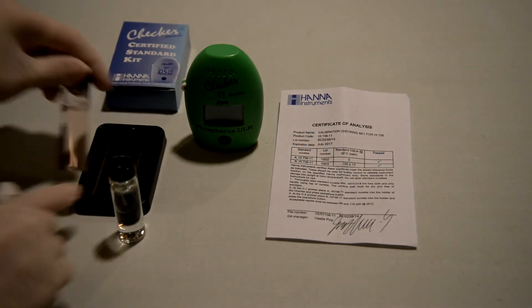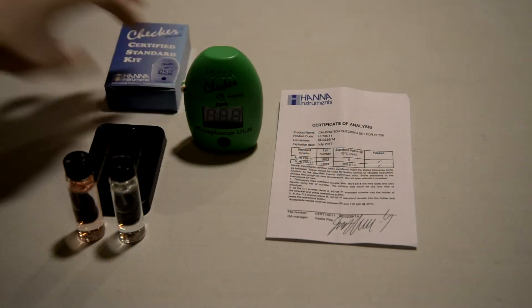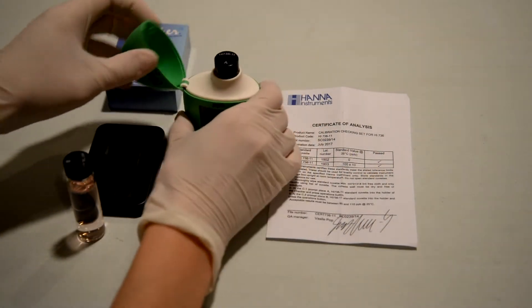The calcium, alkalinity, and phosphorus calibration kits are really nice because you can just use your little chem wipe, wipe down the glass tubes, and reuse them in multiple machines to test different checkers at different clients' places.